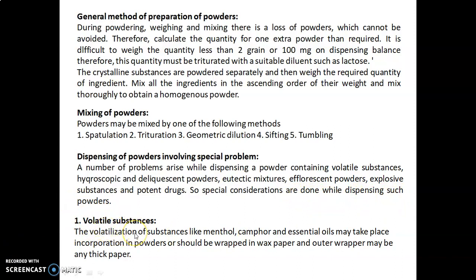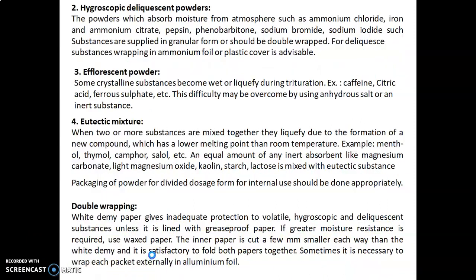Volatile substances. First problem is for the volatile substances. The volatilization of substances like menthol, camphor and the essential oils may take place. Incorporation in the powders, or they should be wrapped in wax paper, and the outer wrapper may be any thick paper.